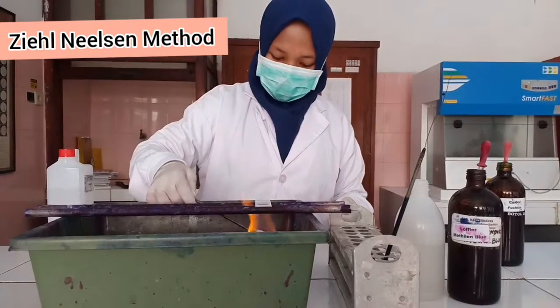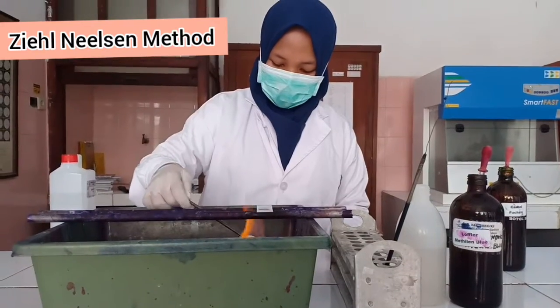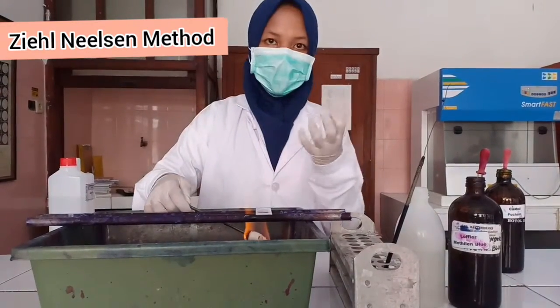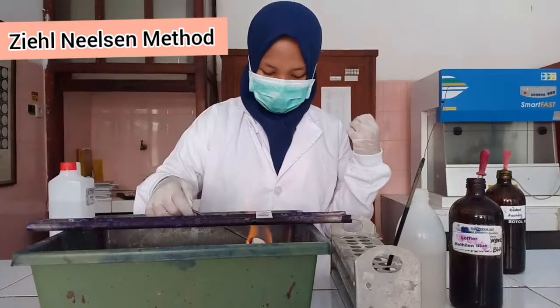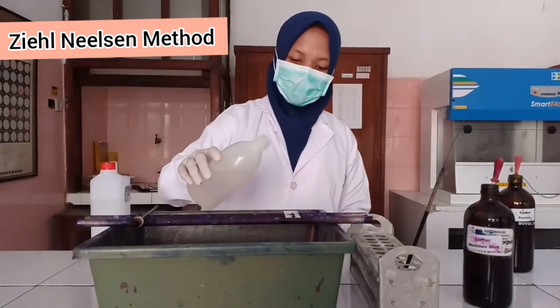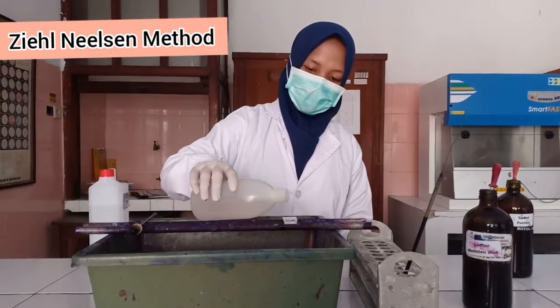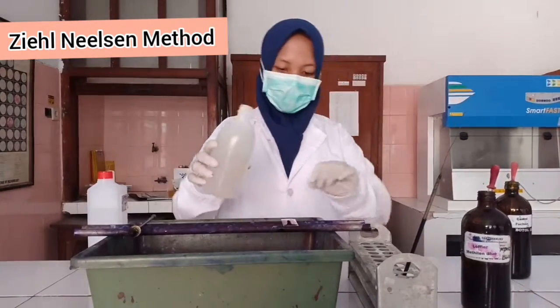Warming it opens the lipid layer of the bacteria so that the stain can get into the bacteria. And cool and rinse with water for 30 seconds.